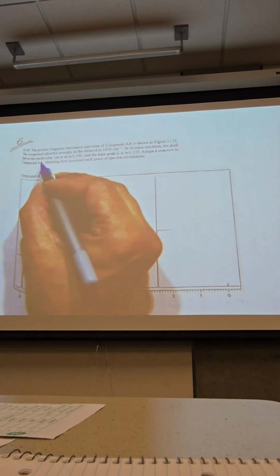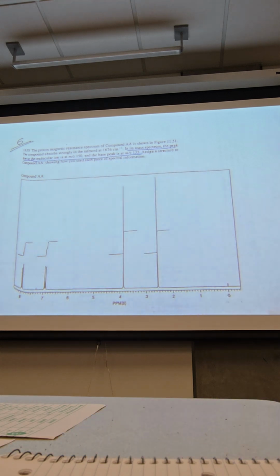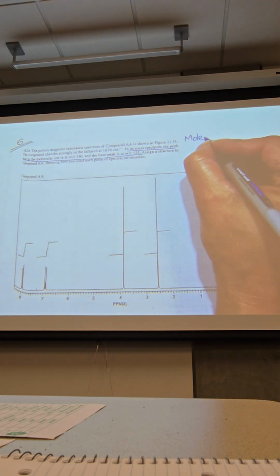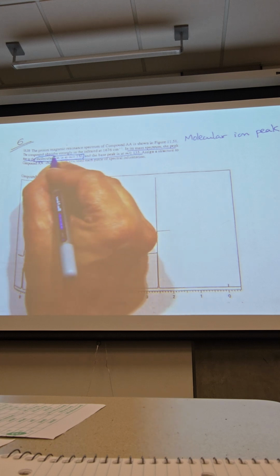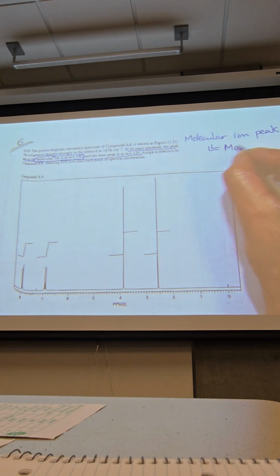Okay. Do you see this information right here? Mass spectrum, the peak due to molecular ion, base peak, and so on. We don't do mass spec in our class. So just FYI, whenever they talk about something called a molecular ion peak, not the base peak, the molecular ion peak, M/Z, that is basically equal to the molar mass of the compound.